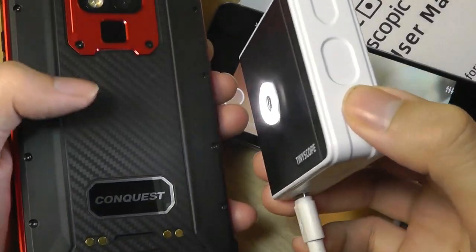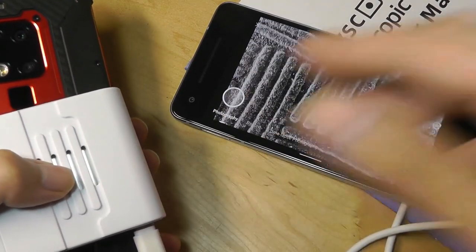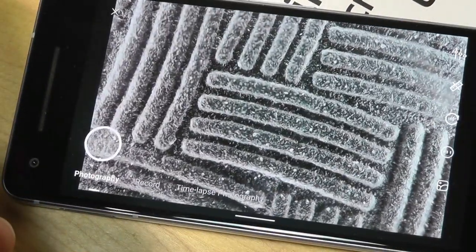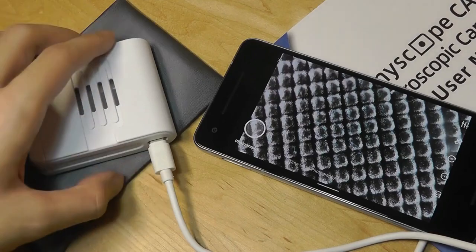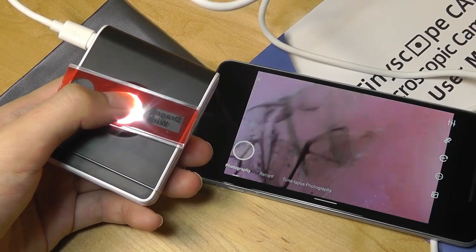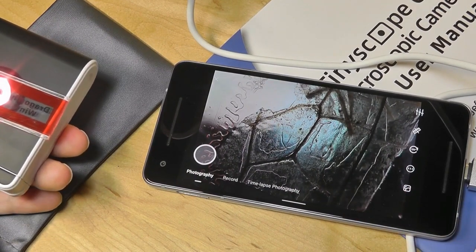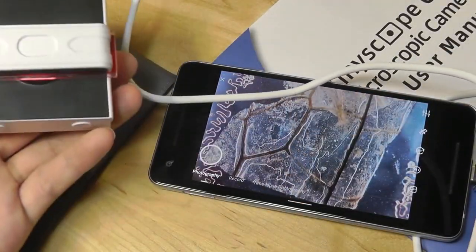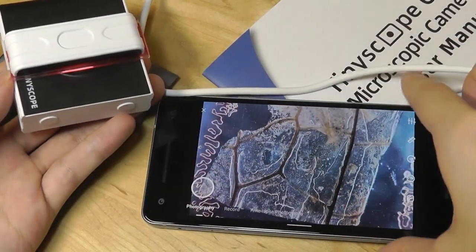I'll do a quick demo here — this is just the carbon fiber texture on the back of a phone case. You can see what it looks like magnified. You can see the autofocus lens working, and it sometimes takes a moment for the image to sharpen and come into focus, but overall it's working surprisingly well. Here's the magnification of this little pouch — the fabric actually looks quite crazy. Let's try some of their included free samples: this is the dragonfly wing, and you can see the background color may be a bit harder to make out, which is why you can snap this over the slide to prevent it from moving and add darkened light so you can see the subject through the LED flash more clearly.